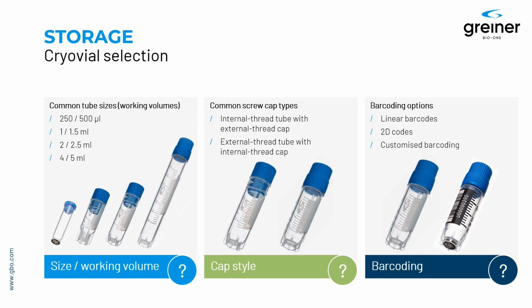With this slide, I want to draw your attention to several features such tubes can have so that you can make a good decision and a good choice. First of all, they come in different sizes and shapes, and it's good to make a good decision here. What is a good working volume for you? Even if they differ, most vendors offer the smaller volumes ranging from 250 to 500 microliters working volume.